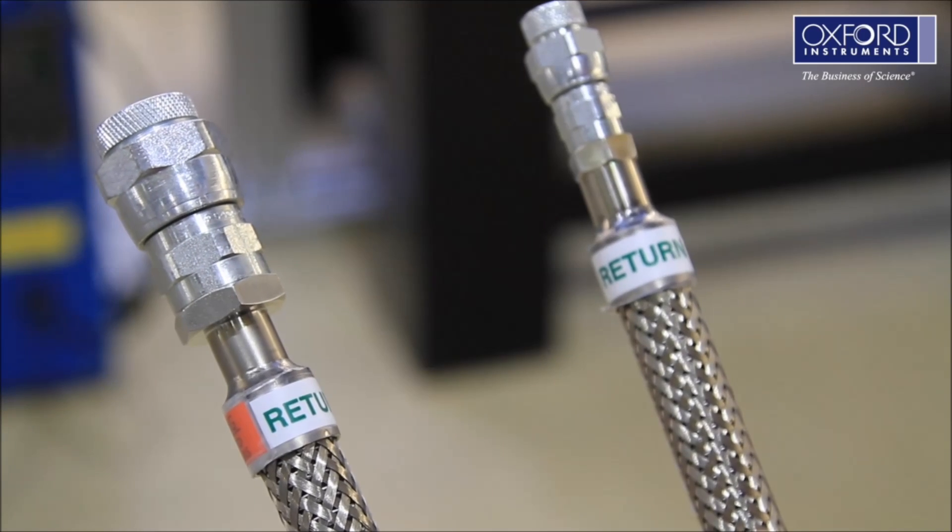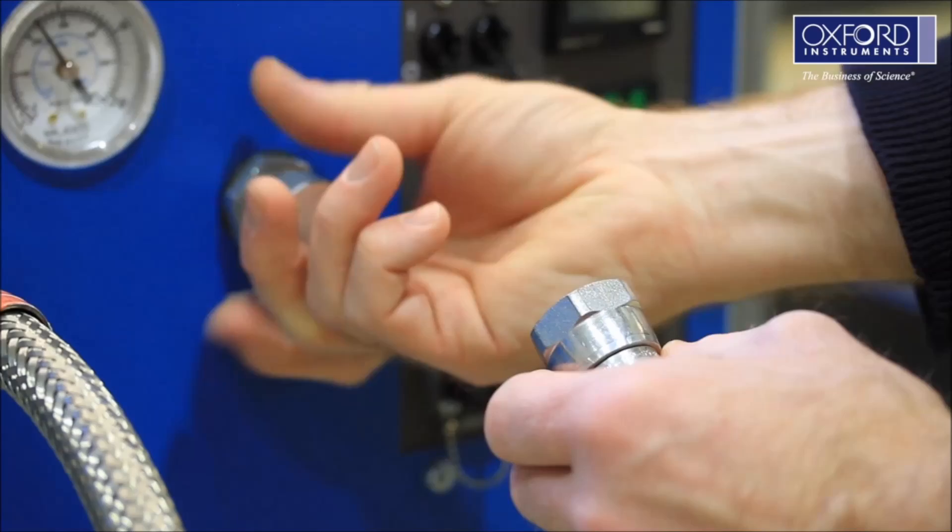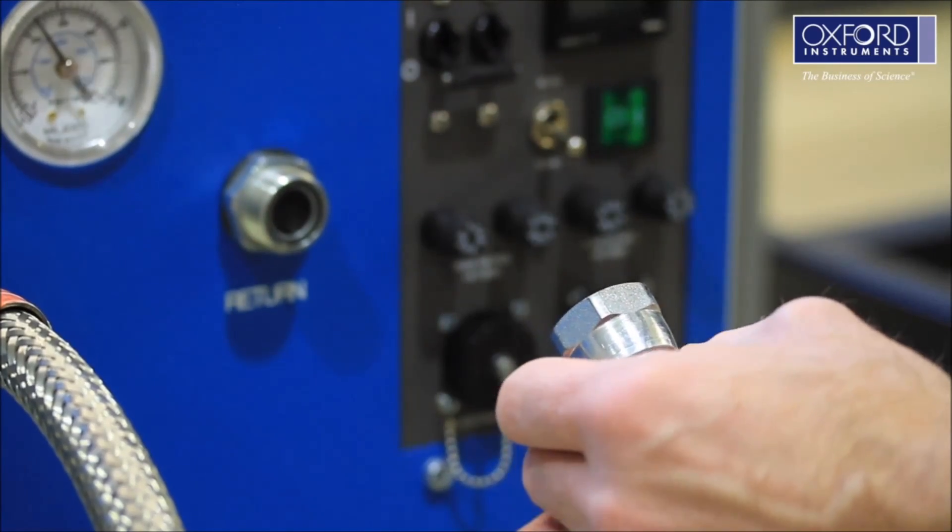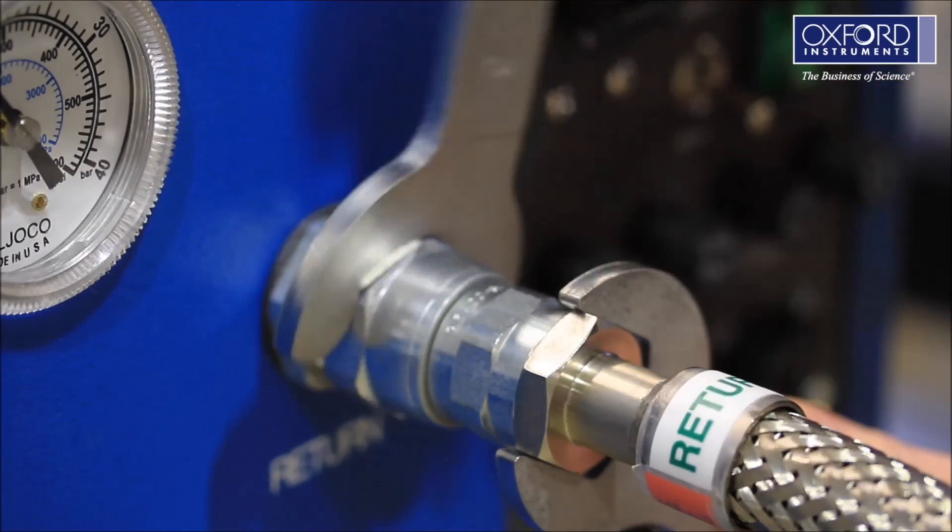Remove the caps and fit the lines to the compressor. Ensure you use two spanners to tighten the fittings.